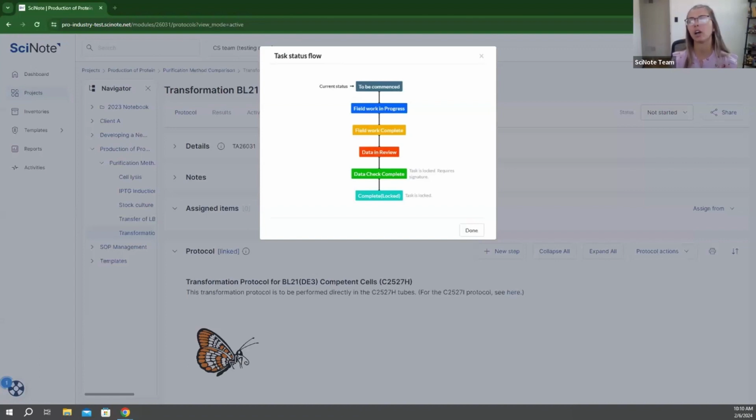So don't just think this is the only option, the end all be all. I also like to say the sky is the limit. I don't know if our developers would like me to say anything and everything, but essentially anything that you are doing right now, we can work with our developers and our technical team to make that a reality.